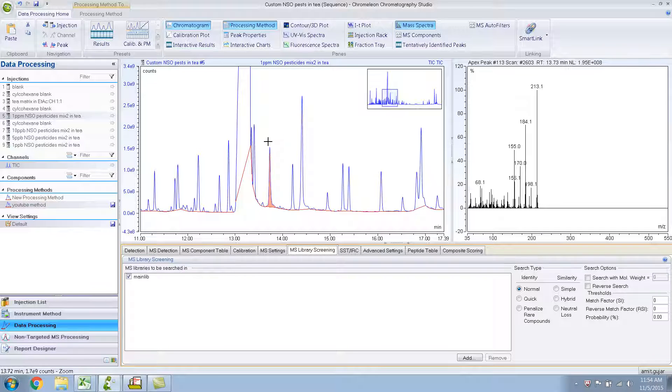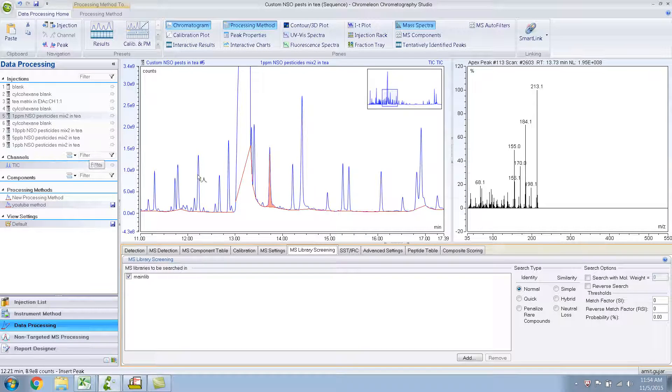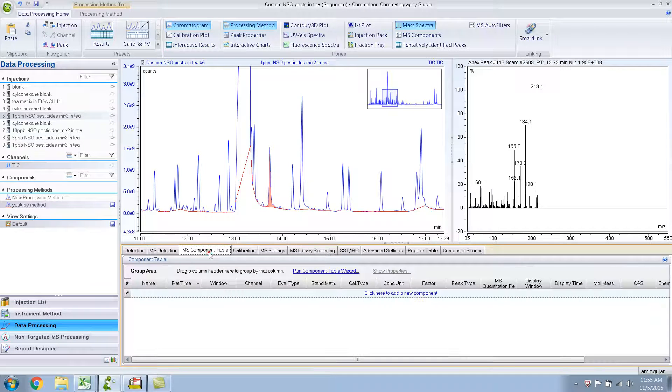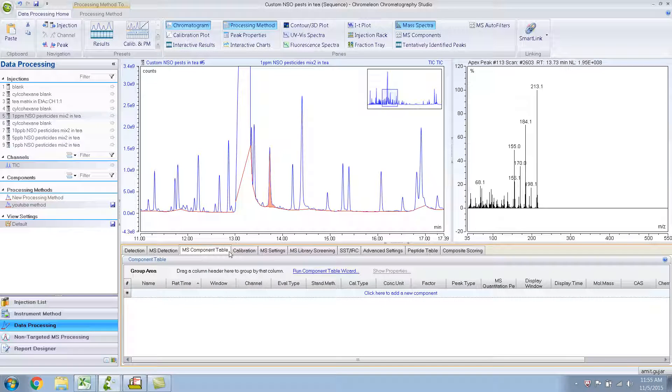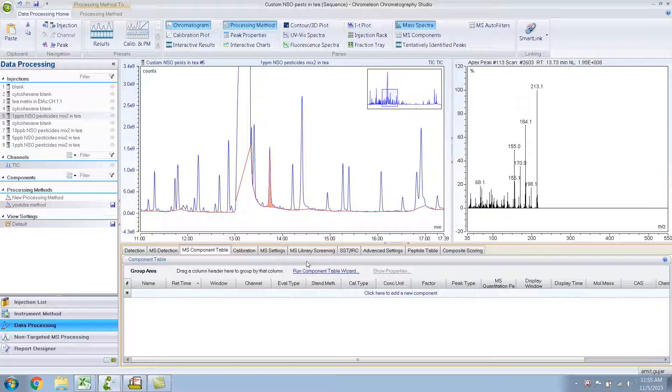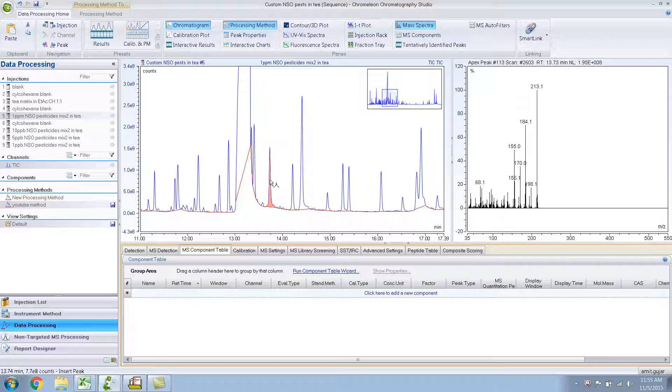To name this peak, to show the name of the peak every time for all the injections, what you need to do is add that particular component in this MS Component Table over here. This MS Component Table is, I think, the most important table if you're doing quantitative work because this is where you would add your analytes, you would add your calibration levels, and this is where you add all the information that is related to the component. I know from my library search that this is Symetron.